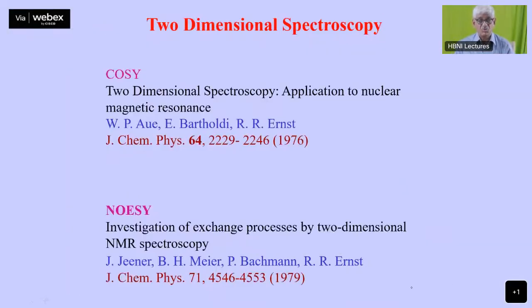Okay. So now we come to the duplex structure determination. We have seen how to identify the duplex. We have seen how the imino protons are telling you about the stability of the duplex, how it is opening up, and now to determine the finer details of the structure at atomic resolution, we have to go to 2D NMR. In 2D NMR, we analyze the non-exchangeable protons, and the contribution of non-exchangeable protons in NMR spectroscopy is well recognized. That's what we are going to discuss now. How we use this to calculate the three-dimensional structure of the DNA at a finer level of detail.